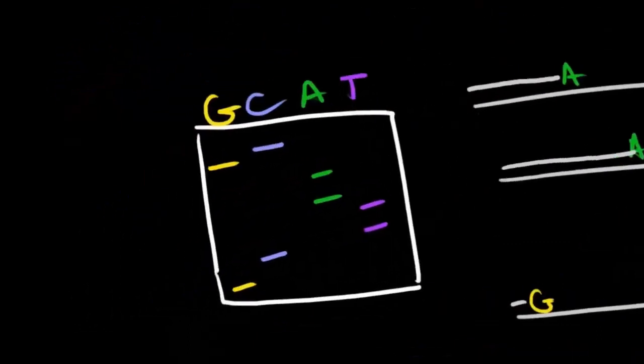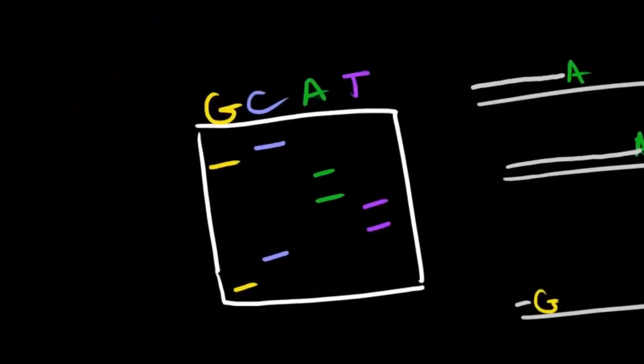Because PAGE gives us 1 base pair differences, we'll be able to know the sequence by... Actually, no, you tell me. How could you determine the sequence by one of these gels? What goes fastest on a gel again? And would an early stunt of elongation make a small strand or a big strand?